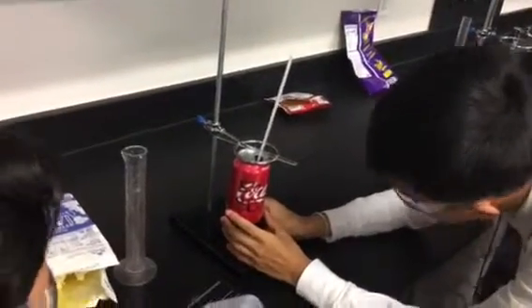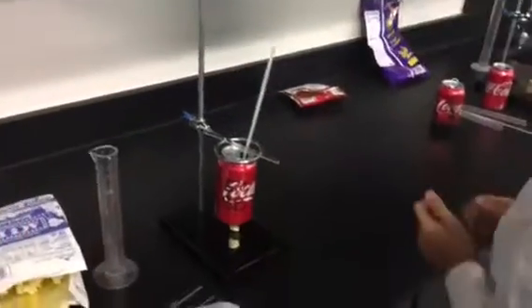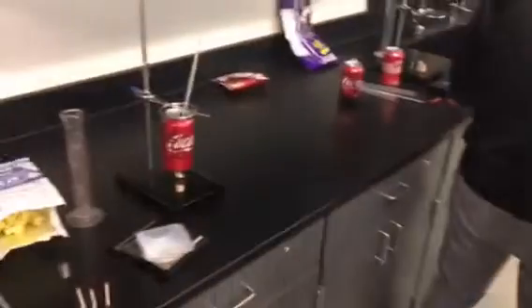We're just lighting the food sample. Safety first. You ask the teacher for permission. An adult is required.